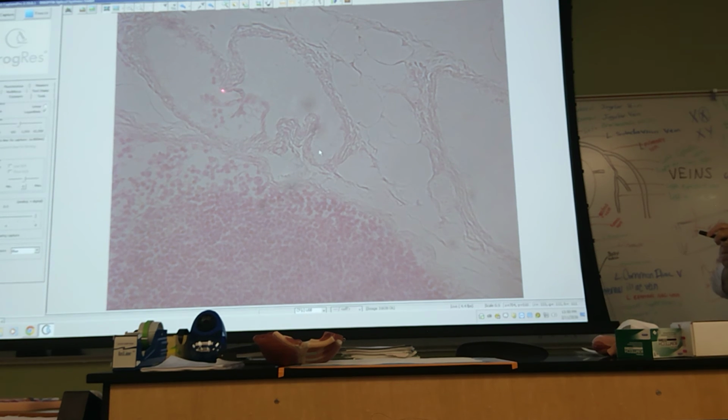And right there is a connection to this piece in here. That piece right there, which then connects to the wall down here. This is a lymphatic valve. Right in there. It's often V-shaped. You can't tell that very well. But this little thread-like part is a valve inside this lymphatic vessel, which is in the pericapsular tissue.